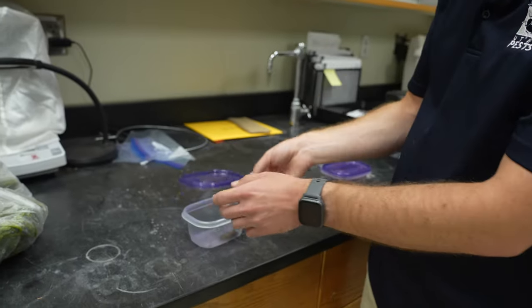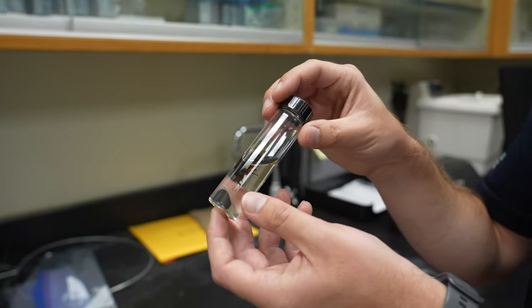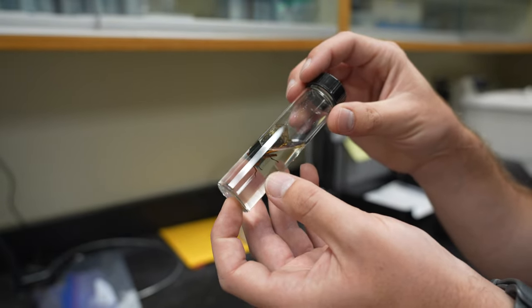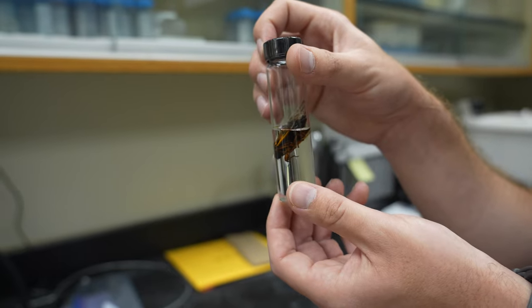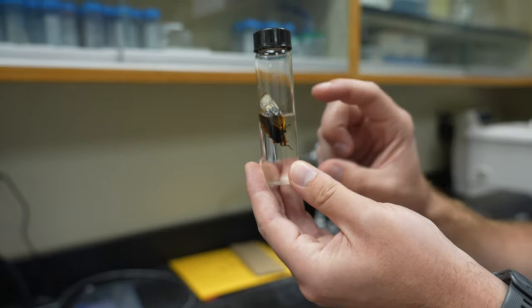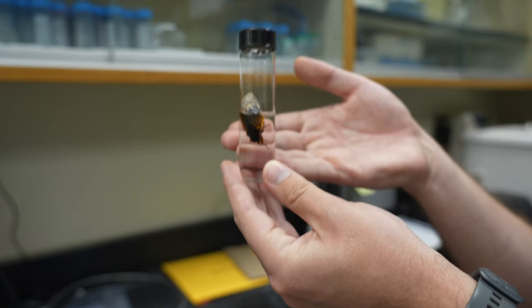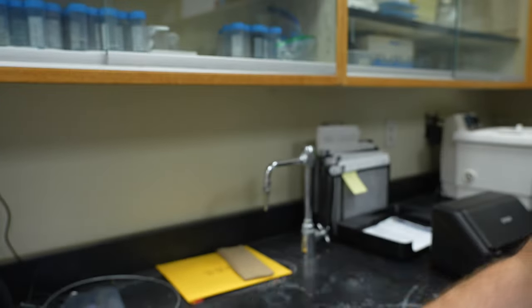The two ways we prefer for you to send in insect samples: first, place the insect in a vial or container that is watertight with rubbing alcohol or ethanol. This is an example of a good submission where the insect is inside ethanol — just enough to cover the insect. Most insects, when freshly collected, will sink to the bottom of the vial or container.